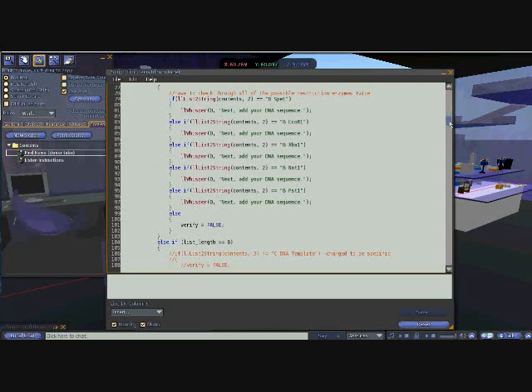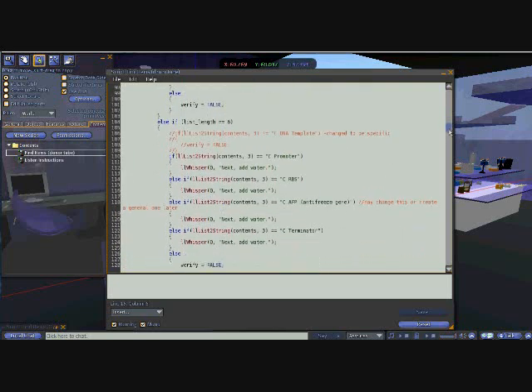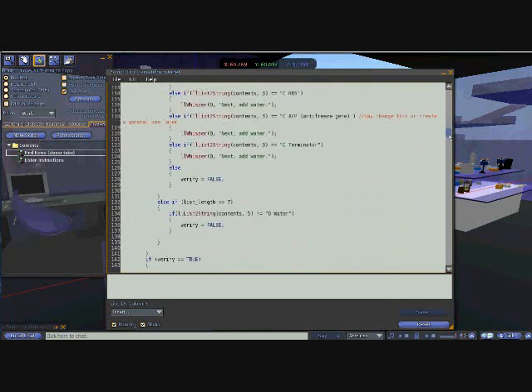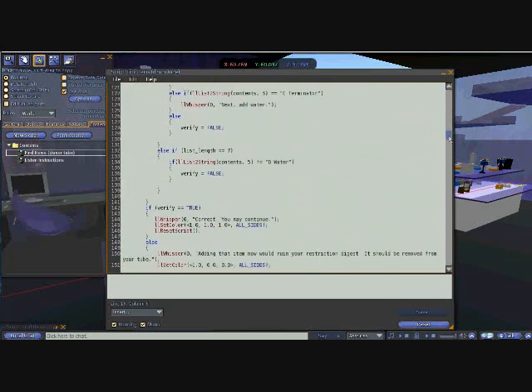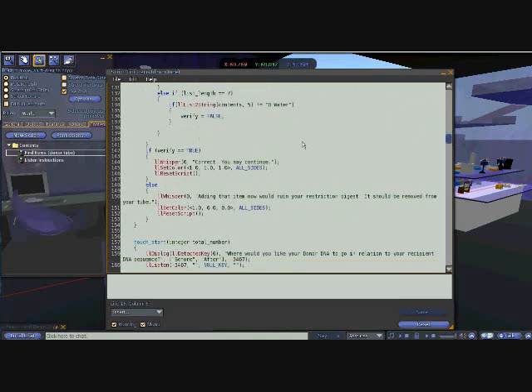But if I add, let's say, the circuit part when I'm supposed to add a restriction enzyme to the tube, it will tell me that my restriction digest will be ruined if I continue and the tube will change its color.